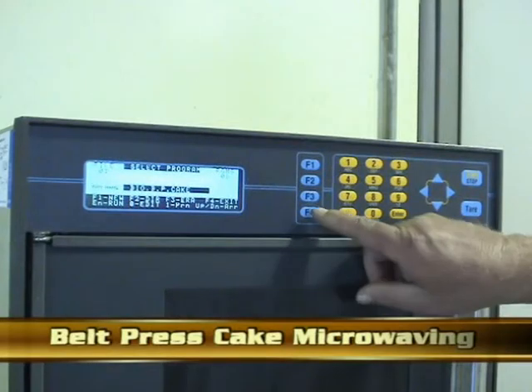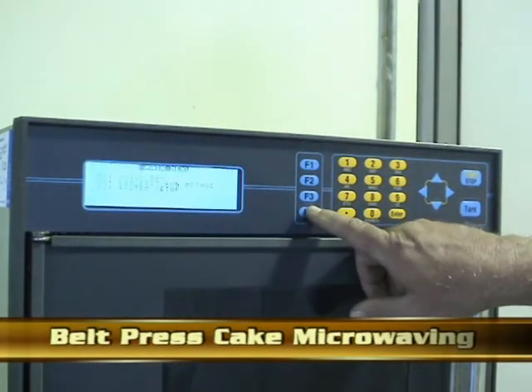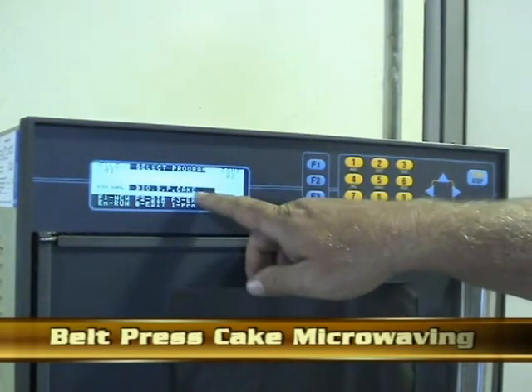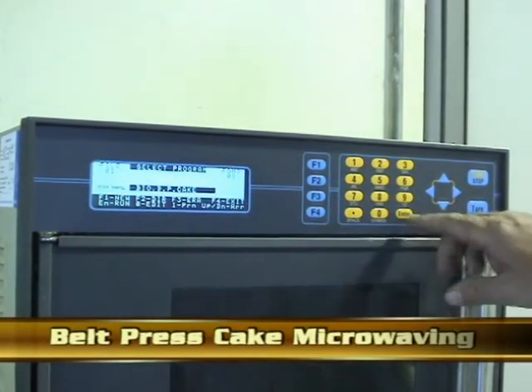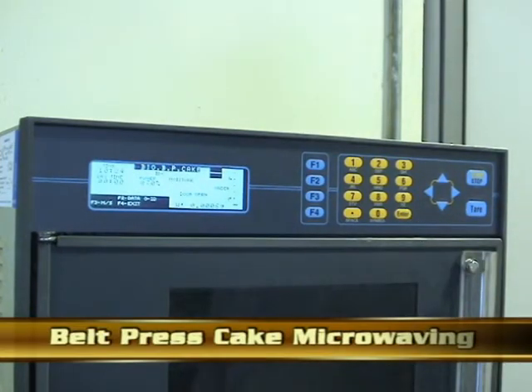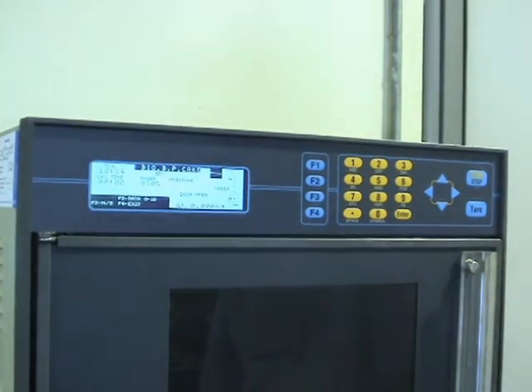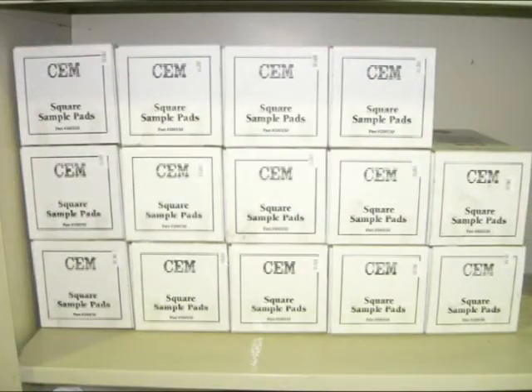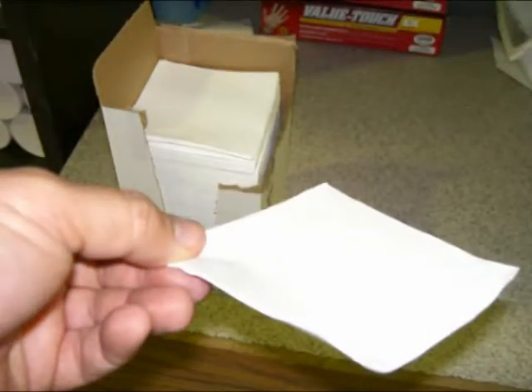The following process is a standard operating procedure for estimating the total solids of a belt press cake. The microwave operator must select a program from pre-installed options. Special 4x4 inch sample pads are used as weighing papers. The sample pads are thick and extremely absorbent.